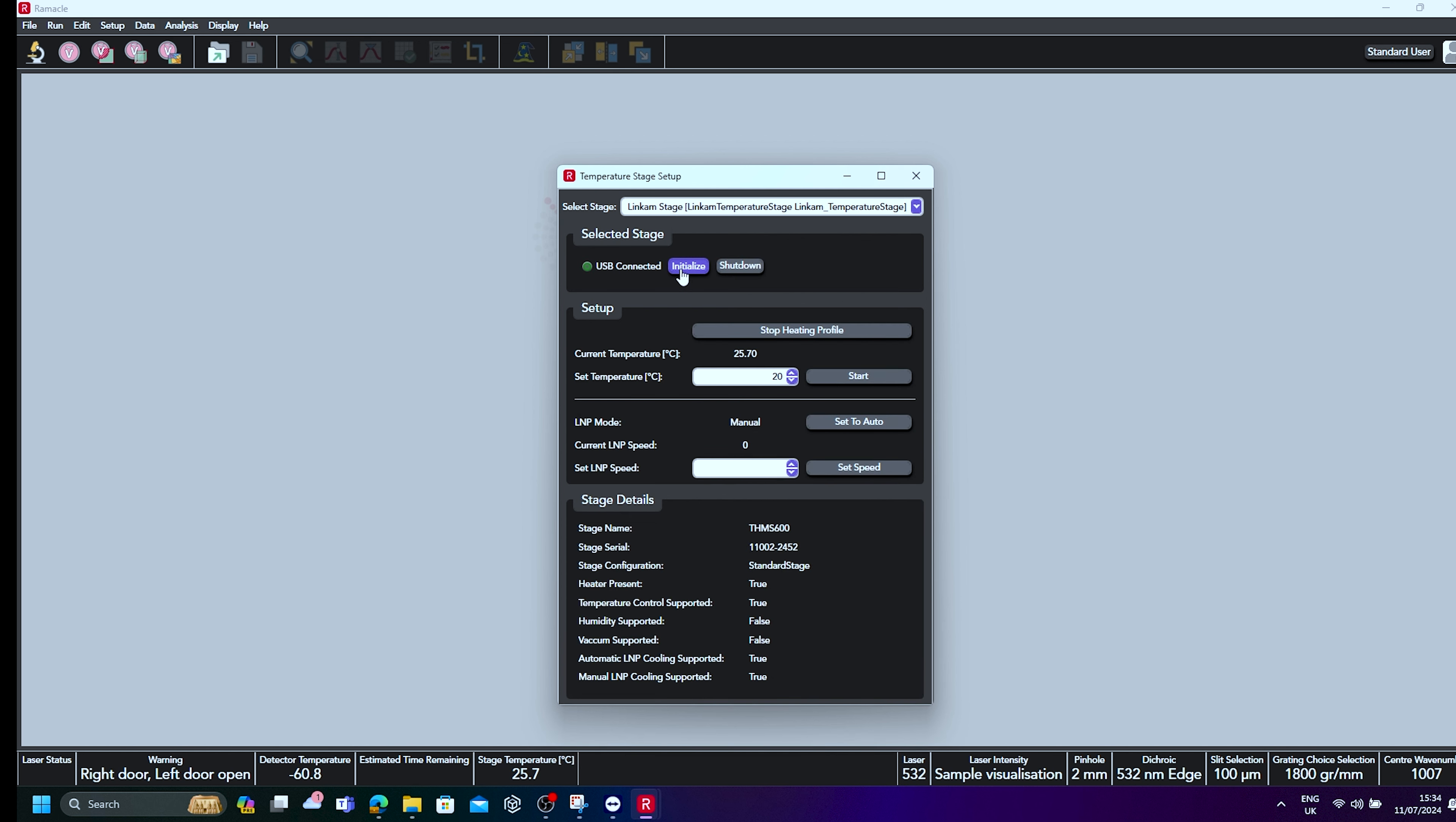Before beginning measurements, it is essential to purge the stage with nitrogen gas. To do this, set the temperature to 30 degrees in Ramico, set the LNP mode to Manual and set the LNP Speed to 100 to begin nitrogen flow into the stage.